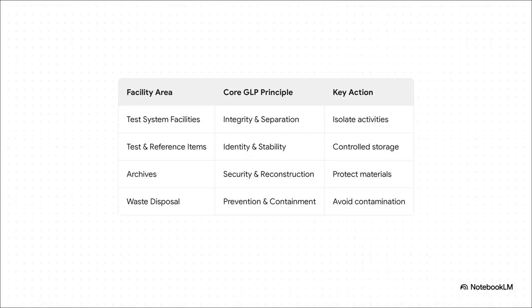And this table really brings it all together. It's a simple summary of our key takeaways. You can see how each area of the facility maps directly to a core GLP principle, and each one has clear, actionable steps you need to take for compliance.